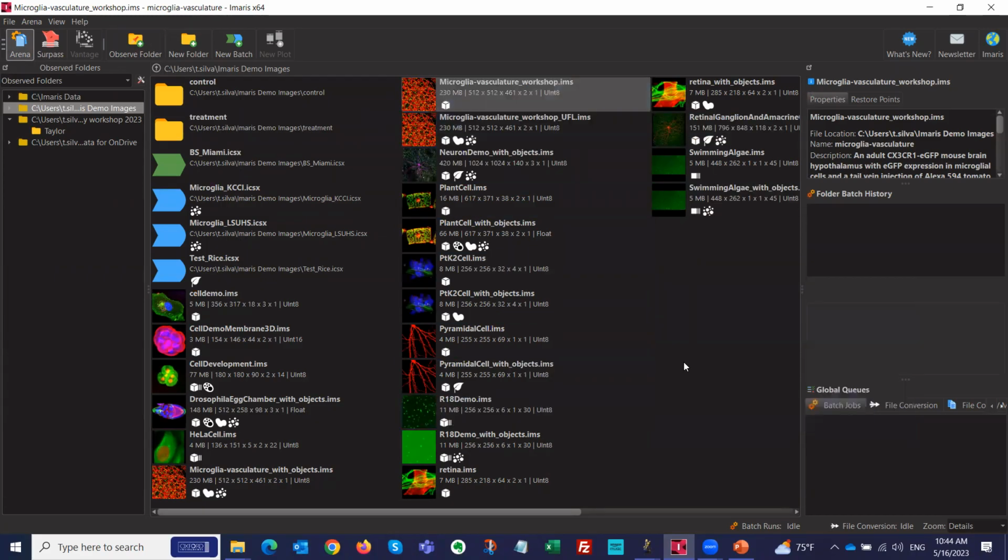These come automatically installed with Imaris itself. So if you want to play with one of those in your free time, if you don't have any images yet, those are available to you at the workstations as well here at Emory. And this is what the arena is.